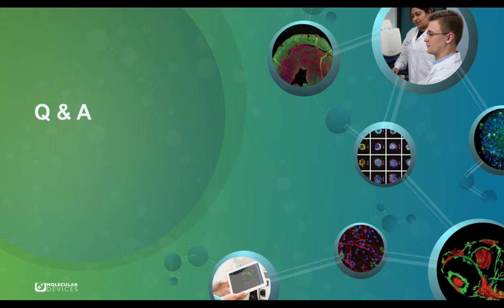Okay, let's get started. Dr. Tang, we have some great questions coming in. Let's start with this first one. Can event detection, like template search, single channel search, be done in batch analysis?